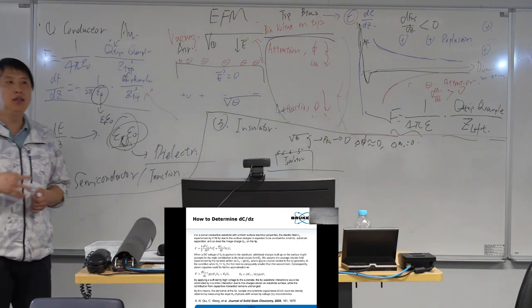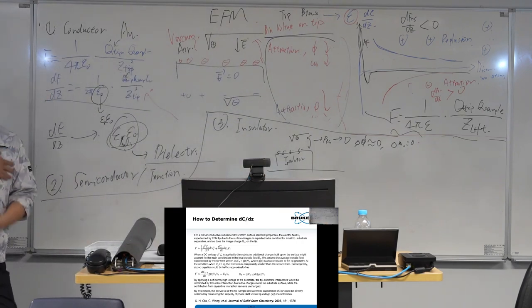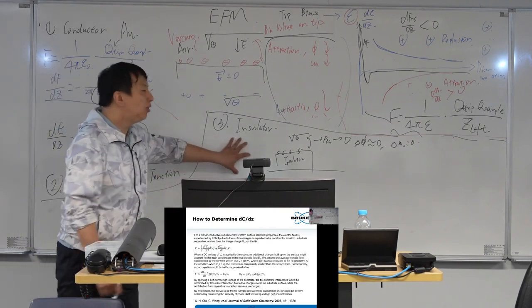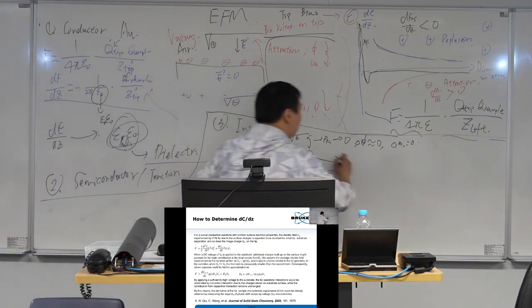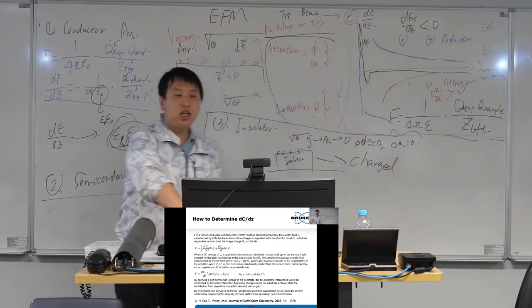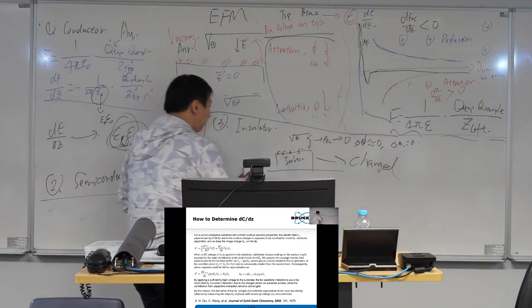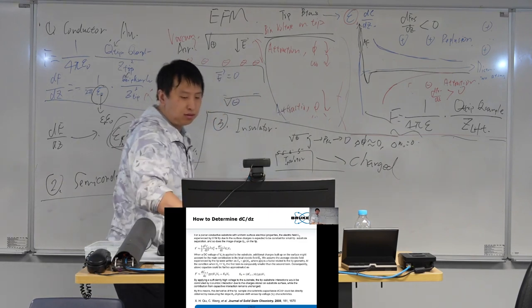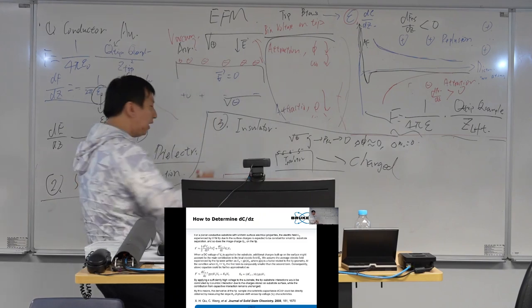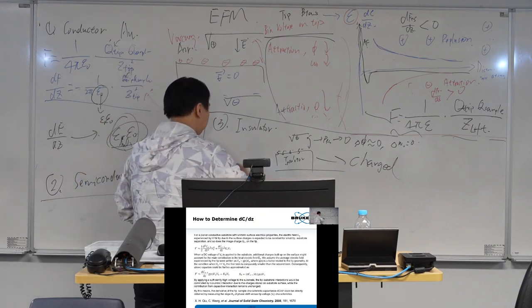That's why in the winter you will find your wool sweater is fully charged with electrostatic charges. So the insulator has another property, charge. That changed the story. So the sample itself has large charge.